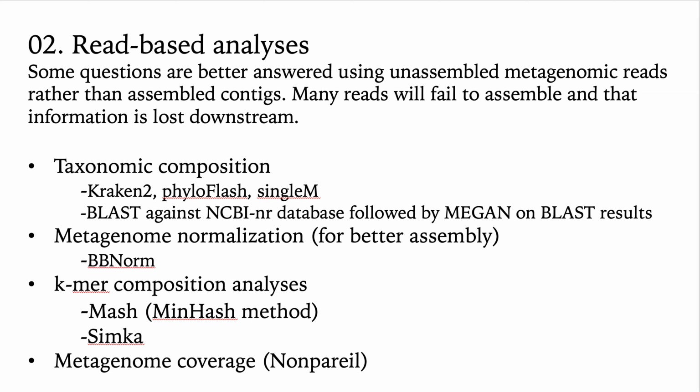You can also do analyses based on k-mer composition. I'll get into a little more detail on k-mers in a little bit, but this can basically be used as a proxy for community composition. And so my favorite program for doing this is called MASH. This is a min-hash method for taking k-mers without any annotation. So you're not using any databases or matching to anything, and you're just assessing the composition of your metagenome based entirely on k-mers.